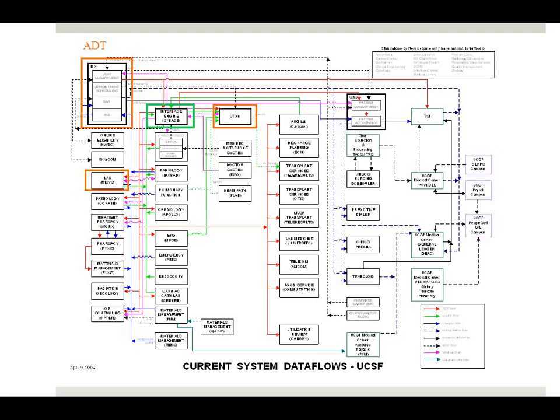And a system like this now is completely dependent more on these pipes than really the separate systems. I mean, it is dependent on the separate systems, but if the pipes break, it's like those systems don't exist. Okay? So if my pipe broke between SunQuest and the interface engine, or the pipe between the interface engine and Apex broke, nothing's going out to the people that need it. Okay, I'm back to doing paper reports at that point.